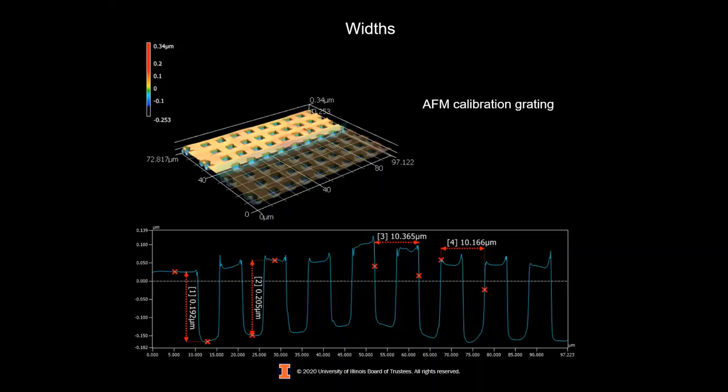Okay, this is kind of related. I'm going to ask a question here. Once you've acquired a series of images, is it possible to automate the analysis, or is this always a manual process? Yes, it's possible to automate the analysis. Almost every 3D optical profiler that I've used or tested has something in the software that allows you to do automation of the analysis. This is one of those instruments that goes between science and manufacturing as well.